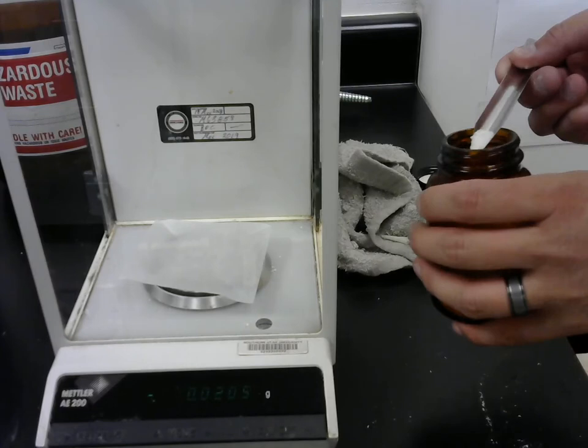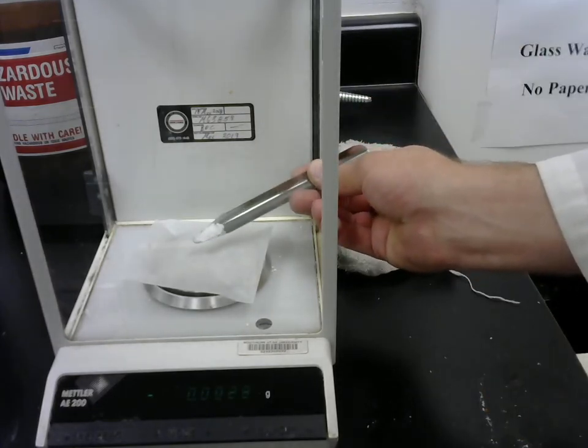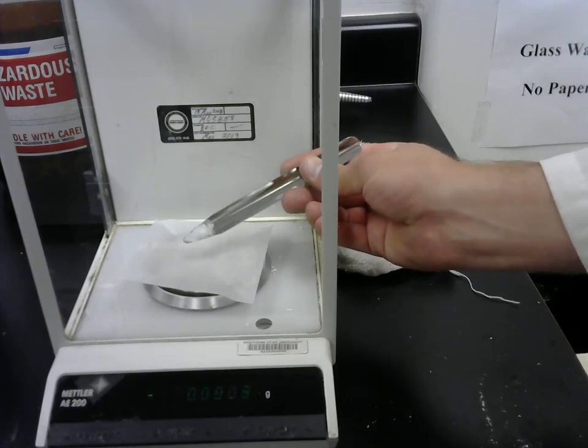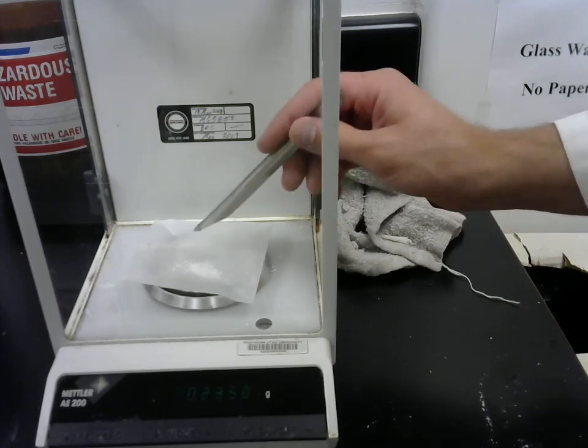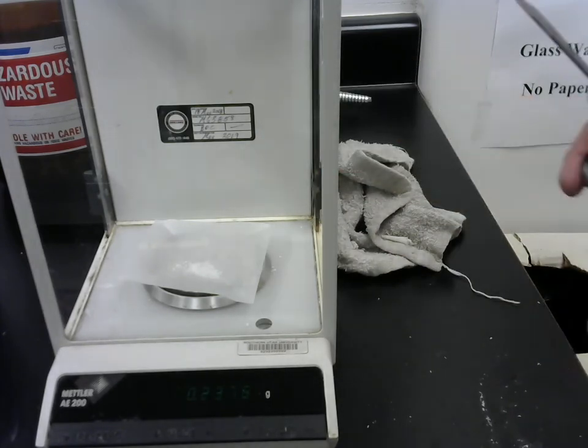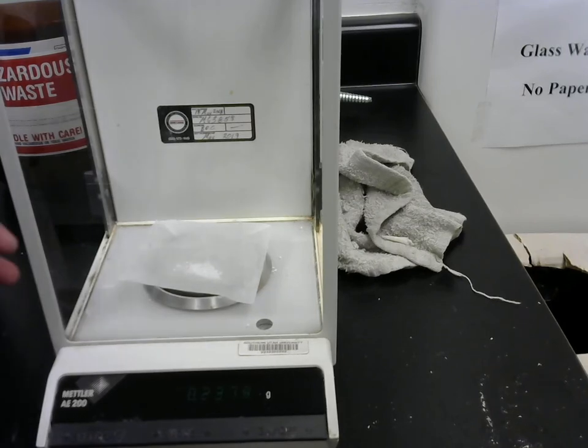So naphthalene is a solid. It smells like mothballs because indeed it is the primary ingredient of mothballs. Oh, you know what? That worked out nicely. A little bit inelegant how I dumped that in there, but that looks like it's about 0.233 grams. It's fluctuating a bit as well, so I'll let you determine how much that is.